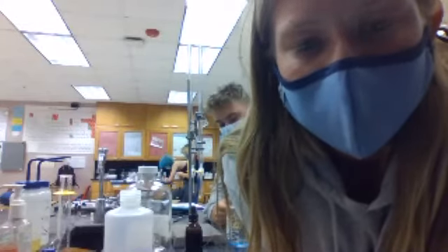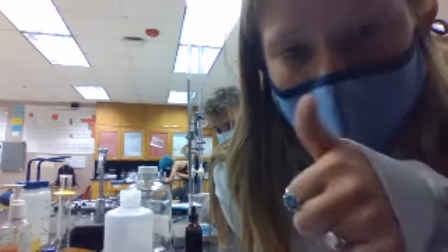What was it? 11.85. And then the pH of, I've lost the milliliters, is 11.85. The new base is ready almost, guys. So prepare. Did you get that? Yes, thank you. Has the graph leveled out yet? Not really. It went 11.29, 11.85. I would get at least one more to see if it leveled.